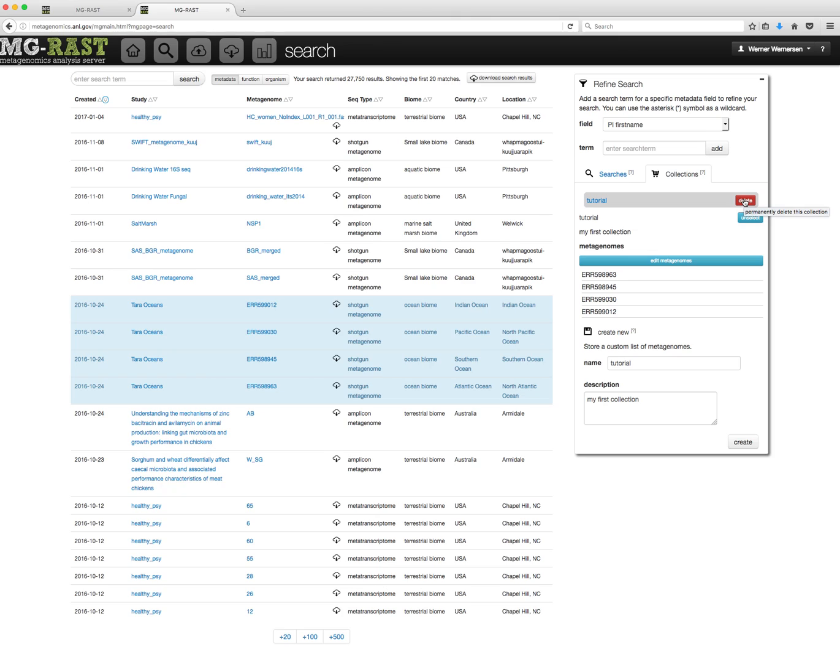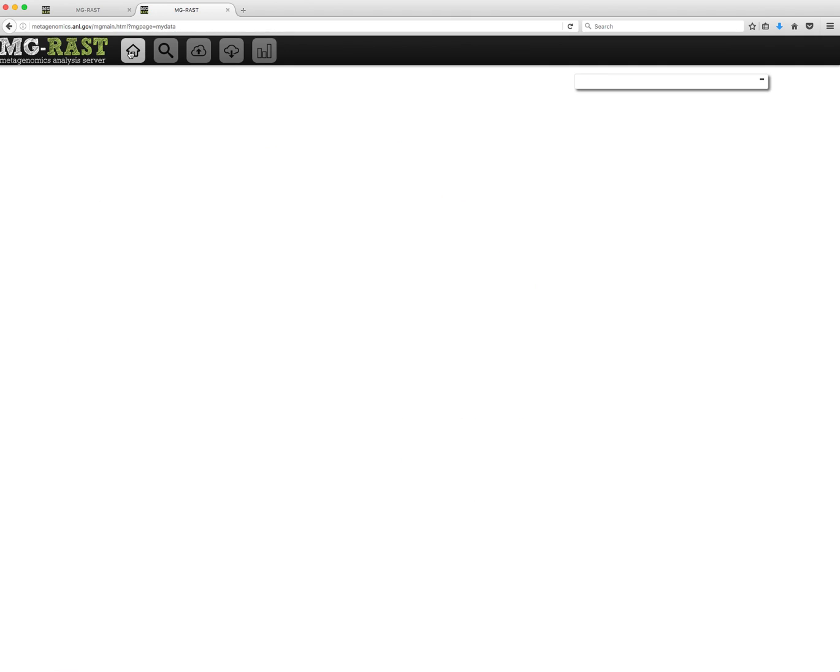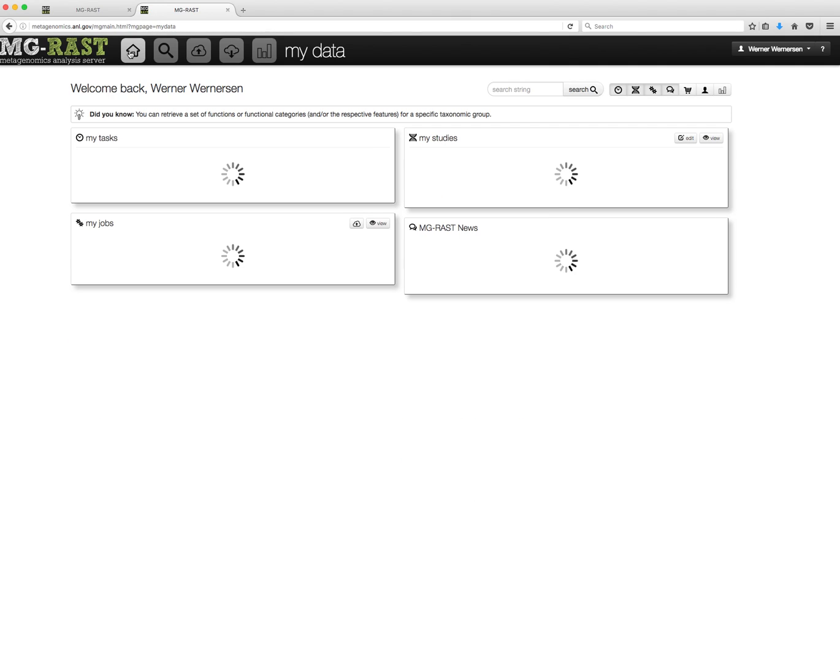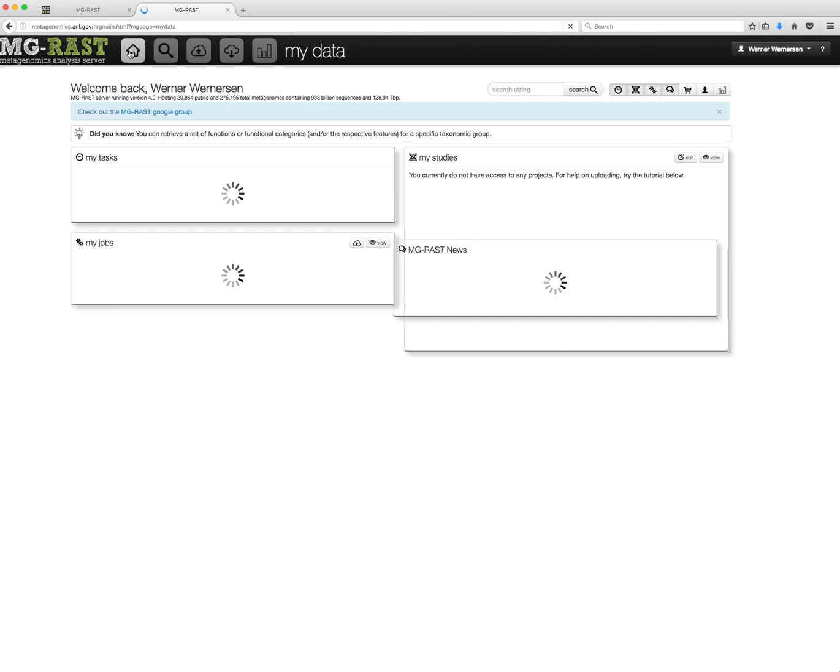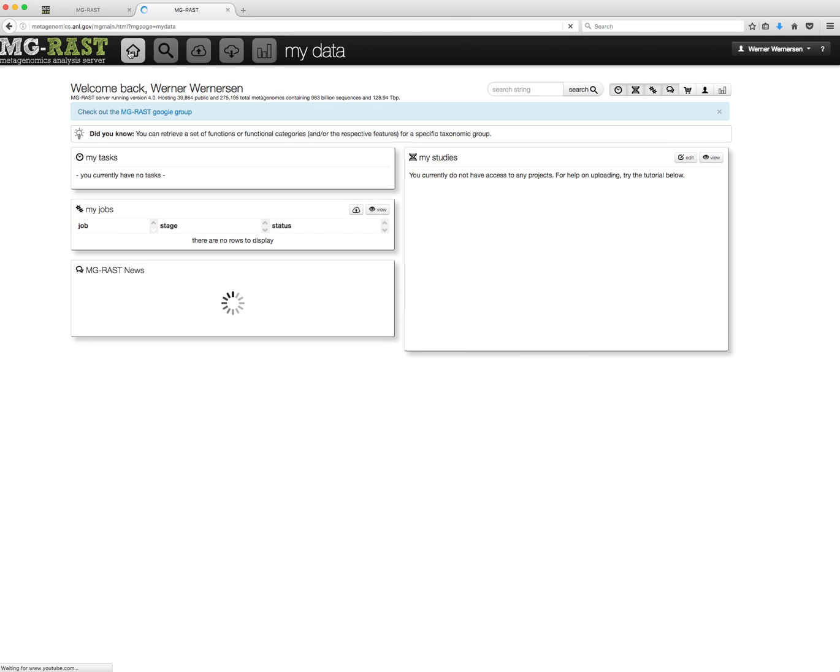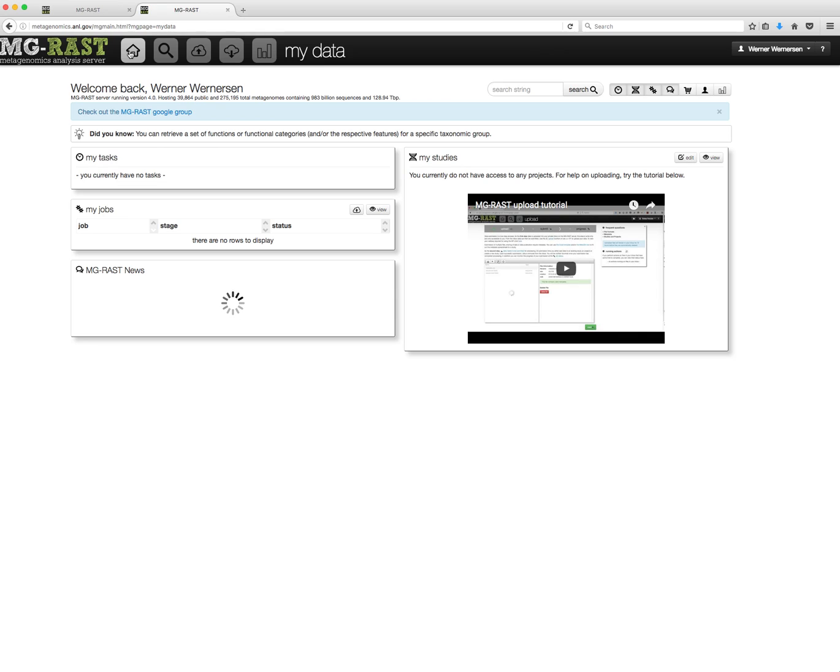In addition to the search page, your collections will be listed on your My Data page, accessible via the house icon in the menu bar. Click the shopping cart icon in the toolbar to display them.